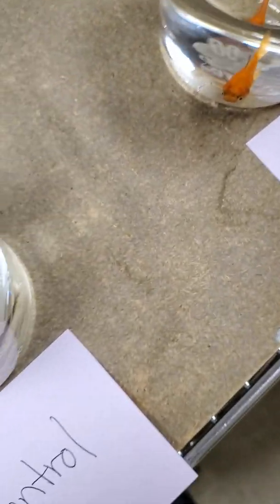And time. We're going to go back to our control. It is 18.1 degrees Celsius.